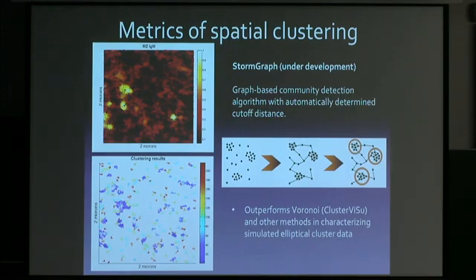When you say outperform, like... Oh, it's just better. I'll show you the poster. But what's your objective, like? So how well does it distinguish? So you put random... Do I really have to tell you this? You put random elliptic clusters with slightly different numbers of points down, and it's able to better segment them into the original ellipses. Okay.